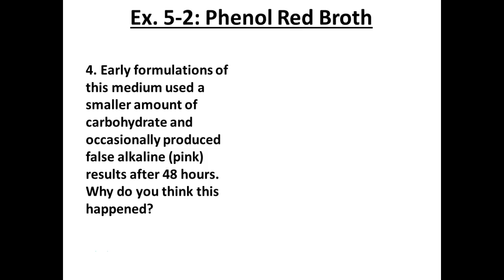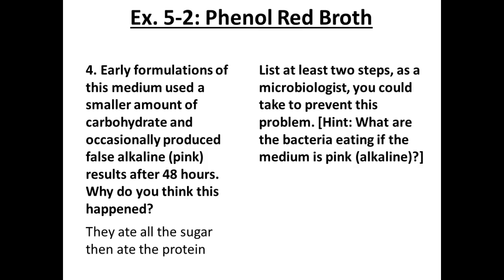So, what happened? They ate all the sugar, right? There was a small amount. Within 48 hours, they blew through it. So, now what are at least 2 steps you could do to prevent this problem? Add sugar, which is what they've done. No? Because you want to know if it eats protein as opposed to ferment.